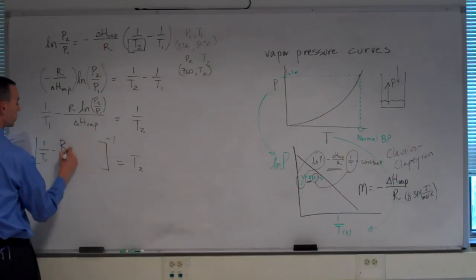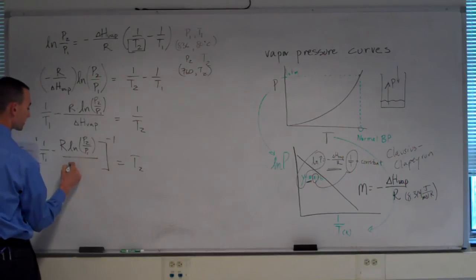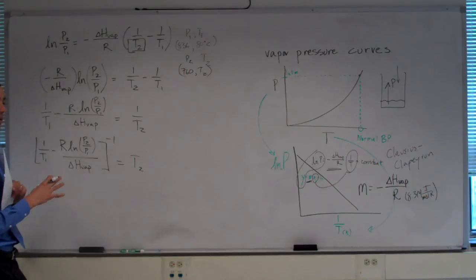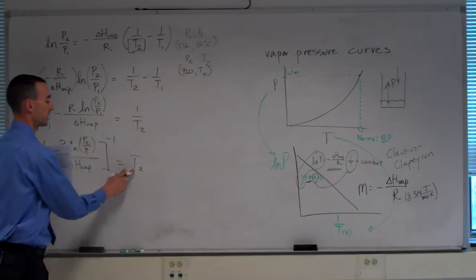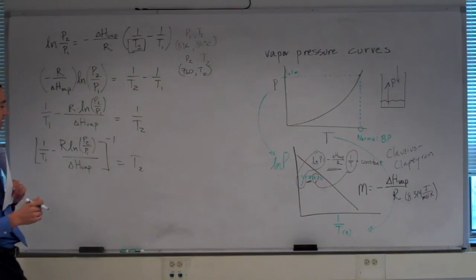Again, since I'll be doing a calculation just like this in the lab, I want to figure out how I can type this into an Excel cell so that it is done over and over again for me so that I can predict the boiling point of water. This is how you'll be predicting the boiling point of water when the time comes to do that calculation.